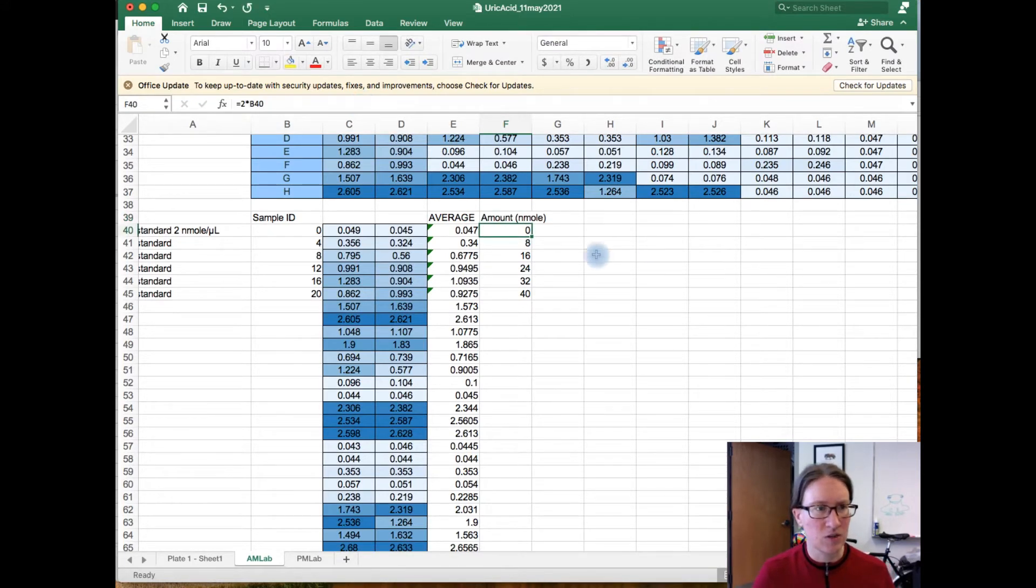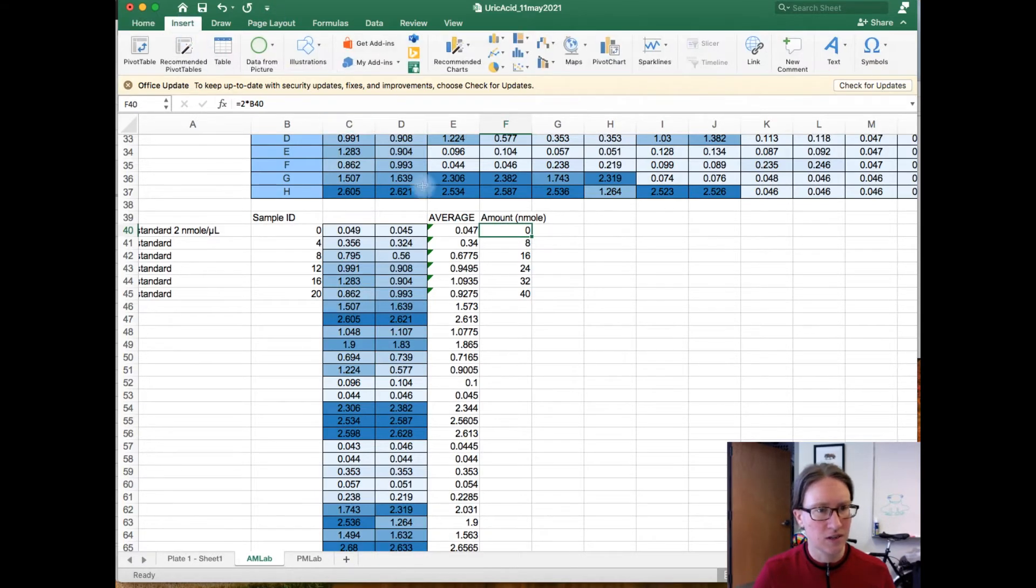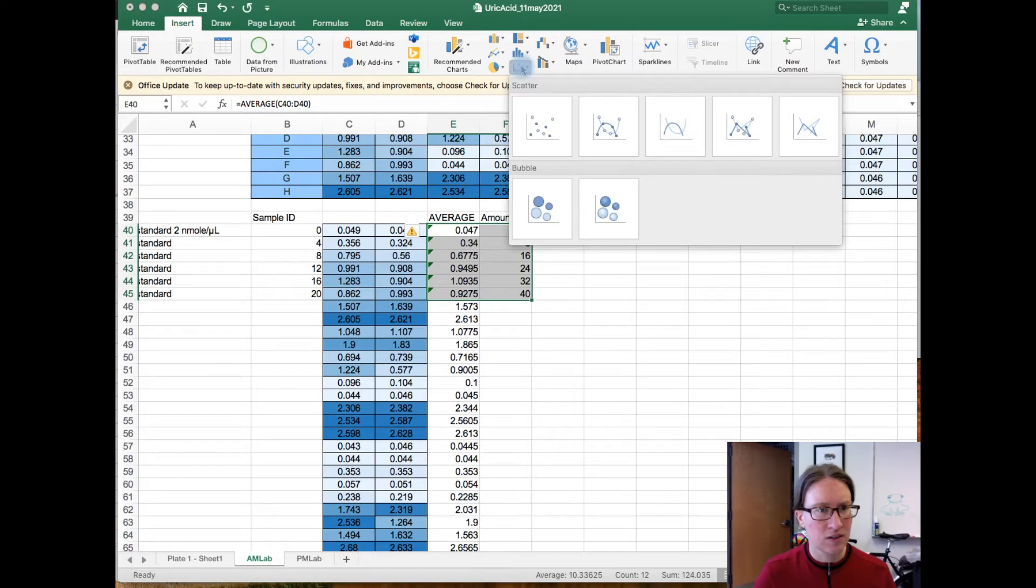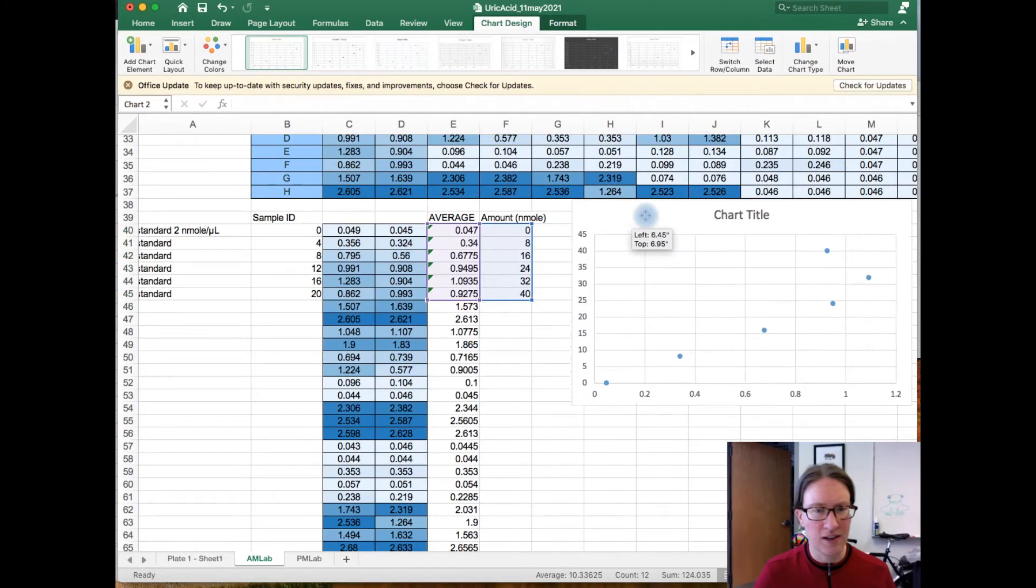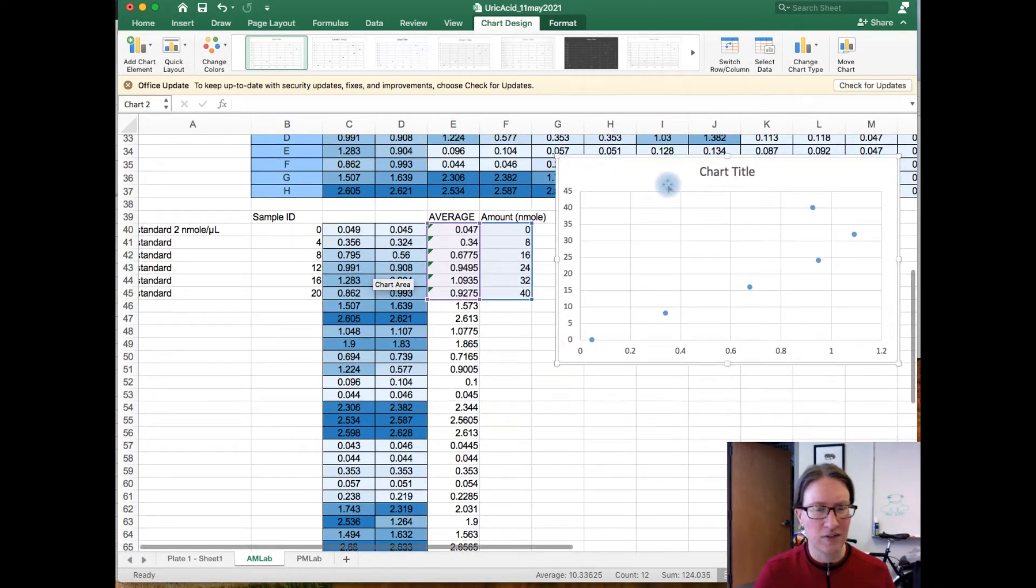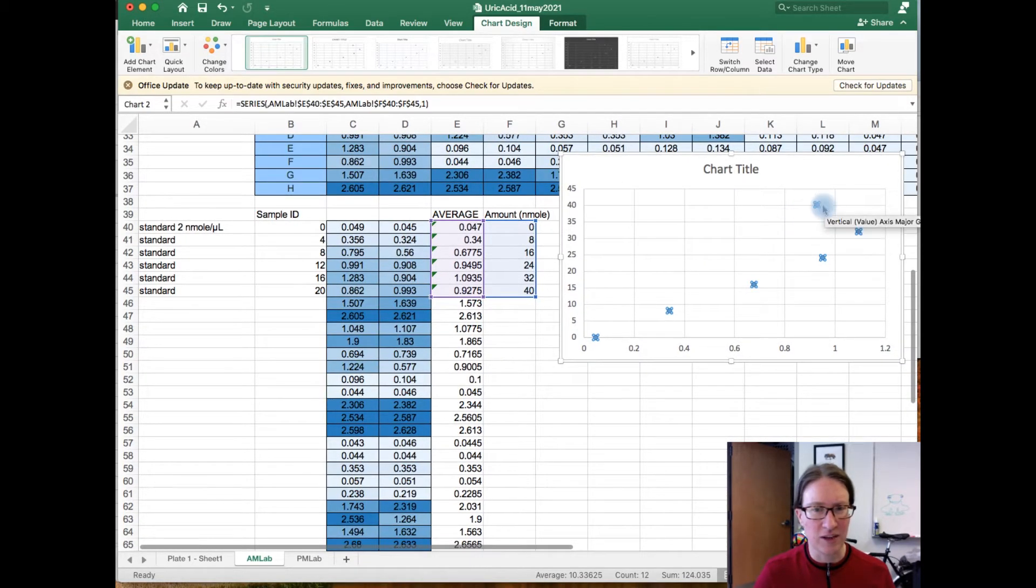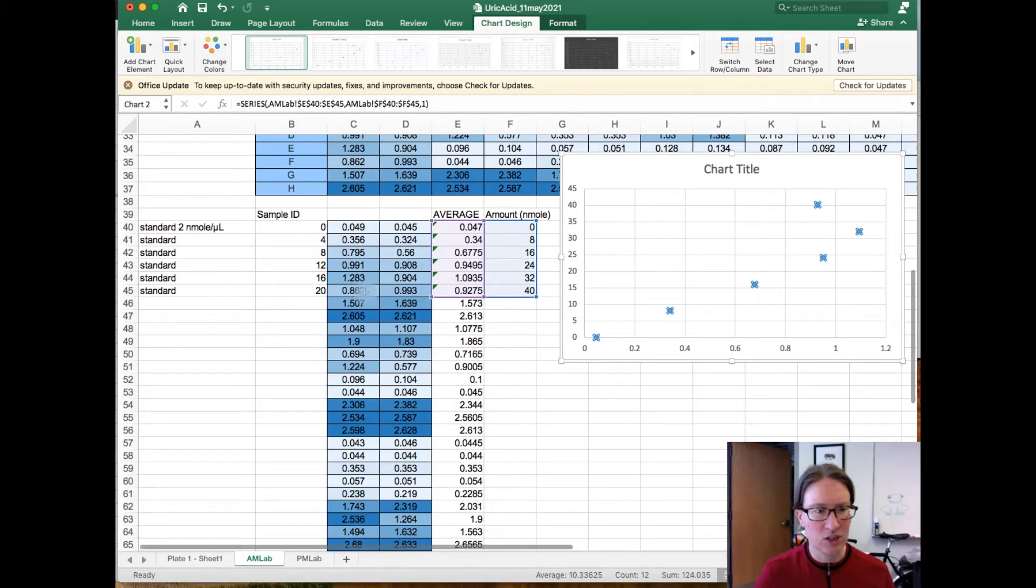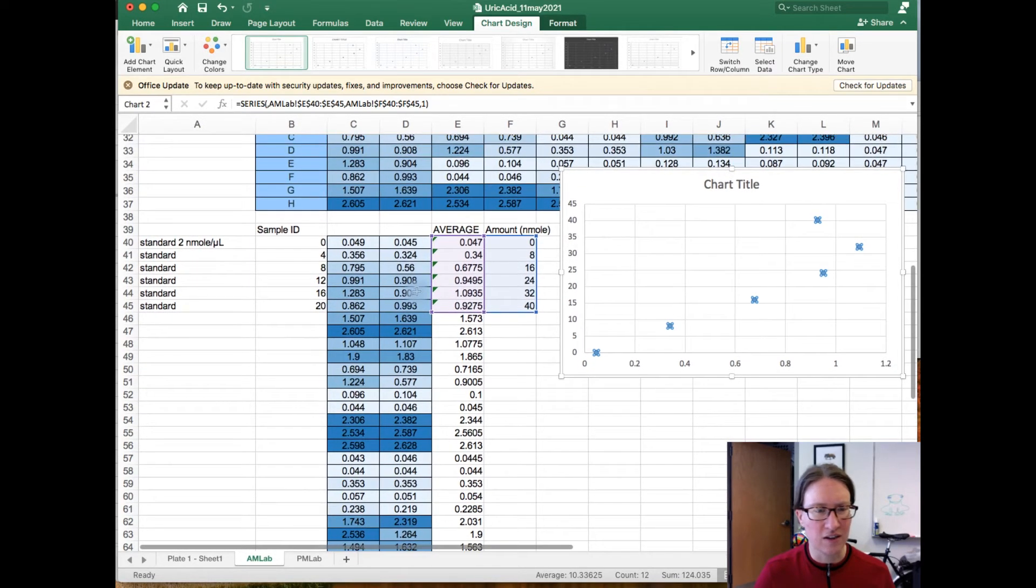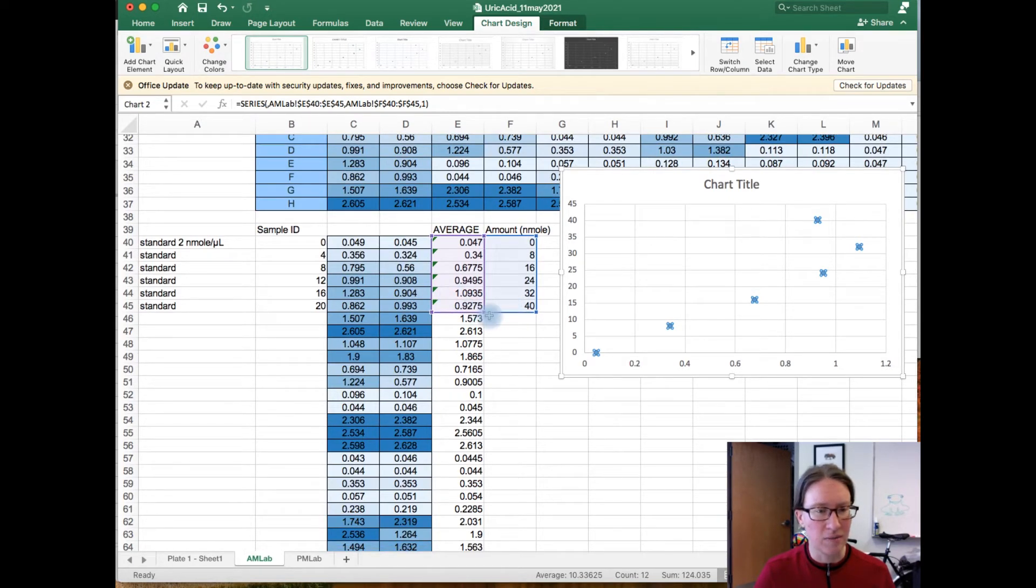So the next step is going to be to generate a standard curve. So I'm just going to go up here, I'm going to highlight the cell range, insert a scatter plot, and it's auto-magically generated for me. And the first thing you'll notice in this scatter plot is we do have one point that is very much an outlier. It's actually this highest concentration is a lot lower than we would predict.